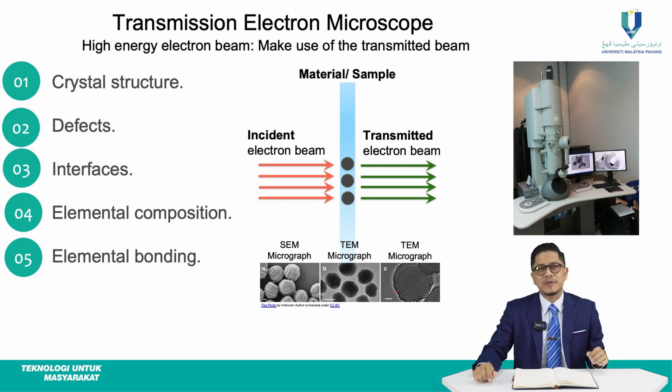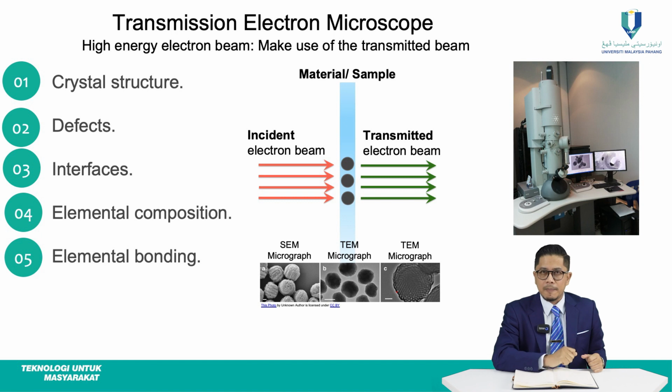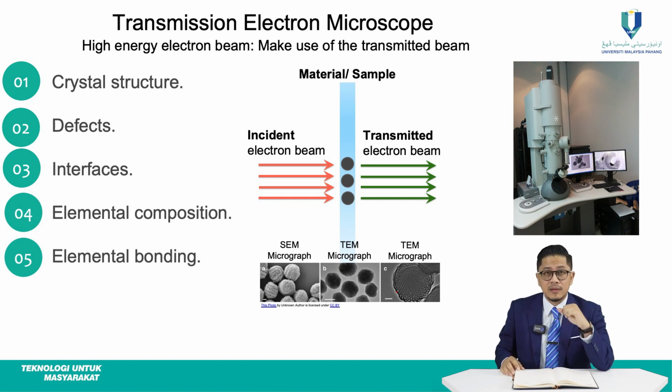TEM also can be used for chemical analysis, providing information on the elemental composition and bonding of materials. With its high resolution and versatility, TEM has become an essential tool for understanding the behavior of materials at the nanoscale and developing new technologies with unprecedented precision.